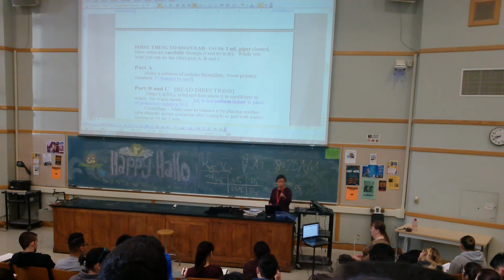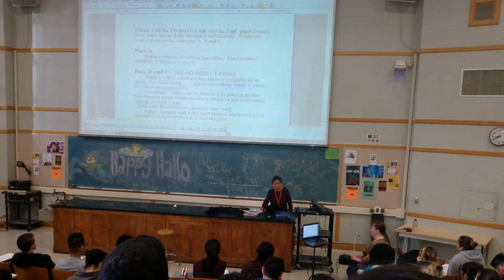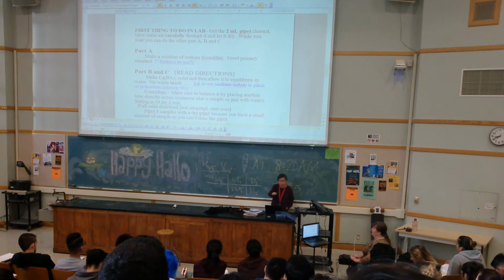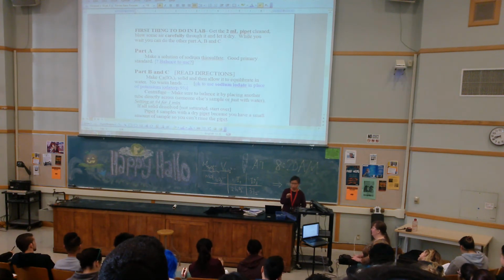So all you have is calcium iodate, and the source of the calcium and the iodate is just coming from the dissolving of the calcium iodate. So you're going to do several washes. You'll be standing there doing this, a whole bunch of you. You're going to centrifuge it, and the manual doesn't say where to put the setting on the centrifuge. You put it at about 4 on the centrifuge and spin it for a minute. You wait for the minute, and you'll hear the spinning sound when it's at full speed. One minute at full speed.